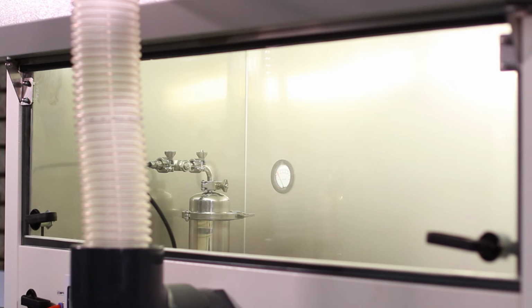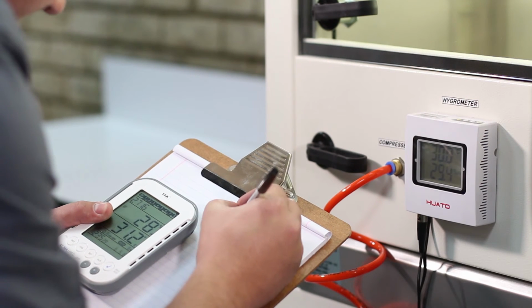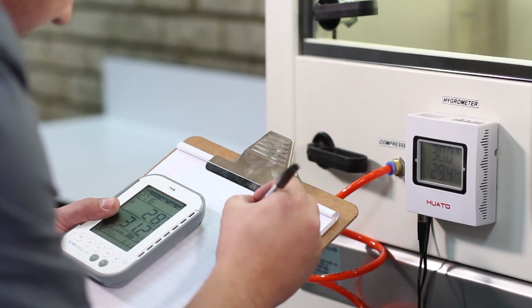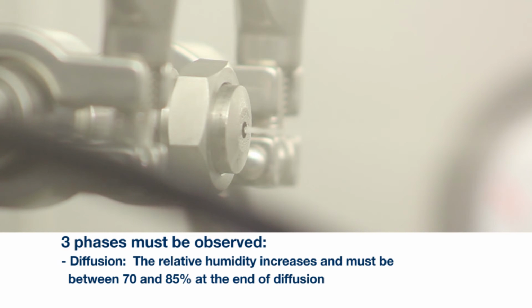Measuring humidity. The disinfection procedure and efficiency is continuously monitored by relative humidity measurements. It is important to have a relative humidity sensor in the cabinet for these purposes. The initial relative humidity will be noted to calculate the quantity of water to be diffused for effective decontamination while limiting condensation as far as possible. If the humidity measurements remain stable during the contact phase, the cabinet is considered airtight and effective disinfection is being achieved.